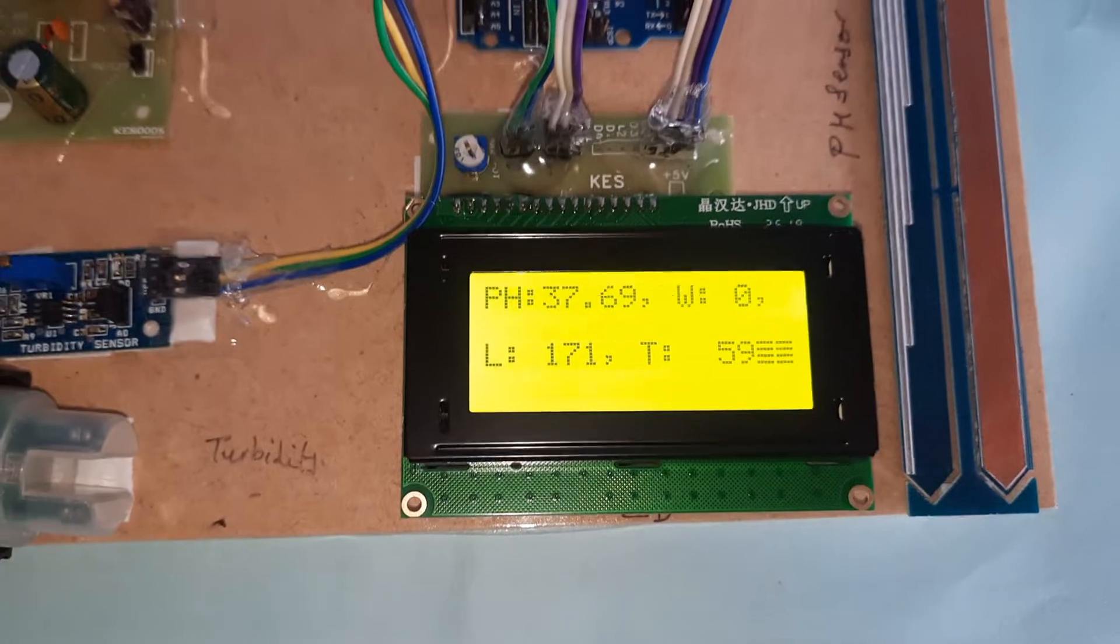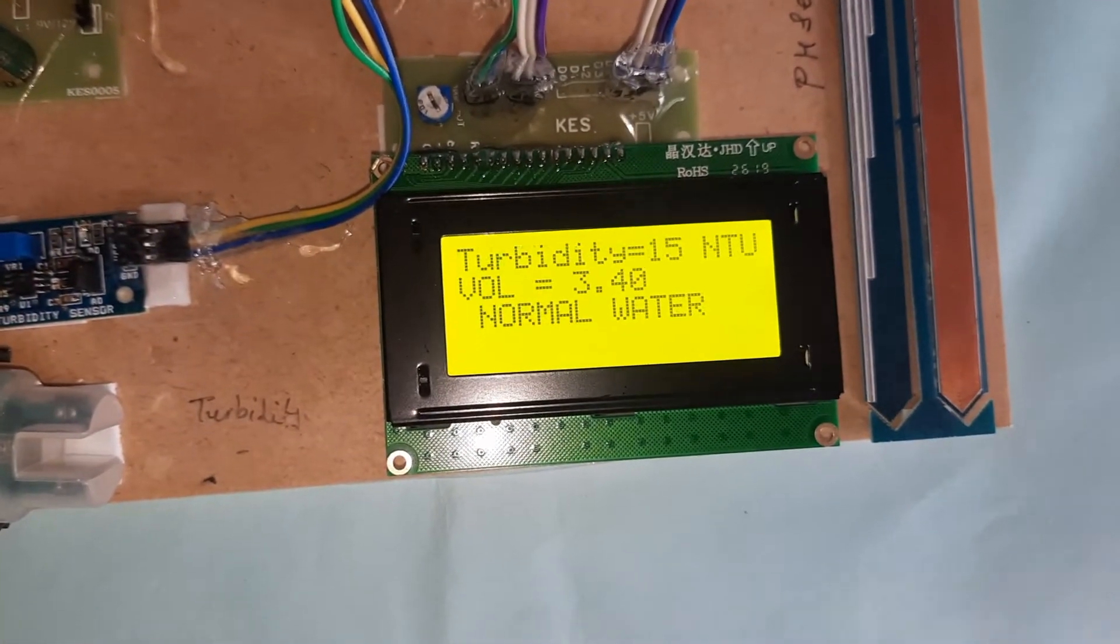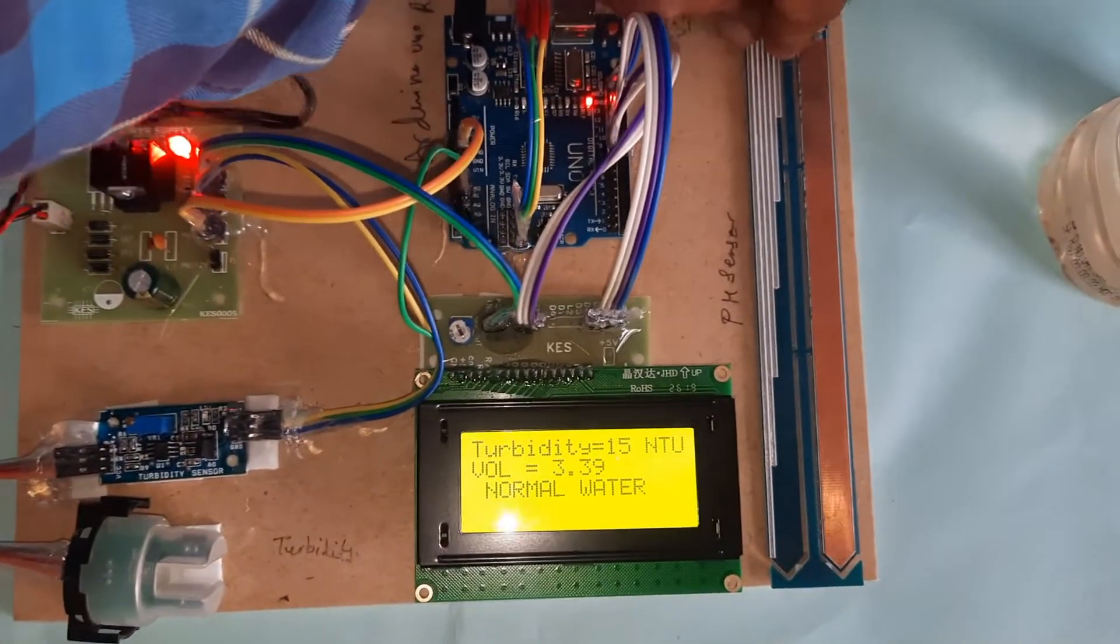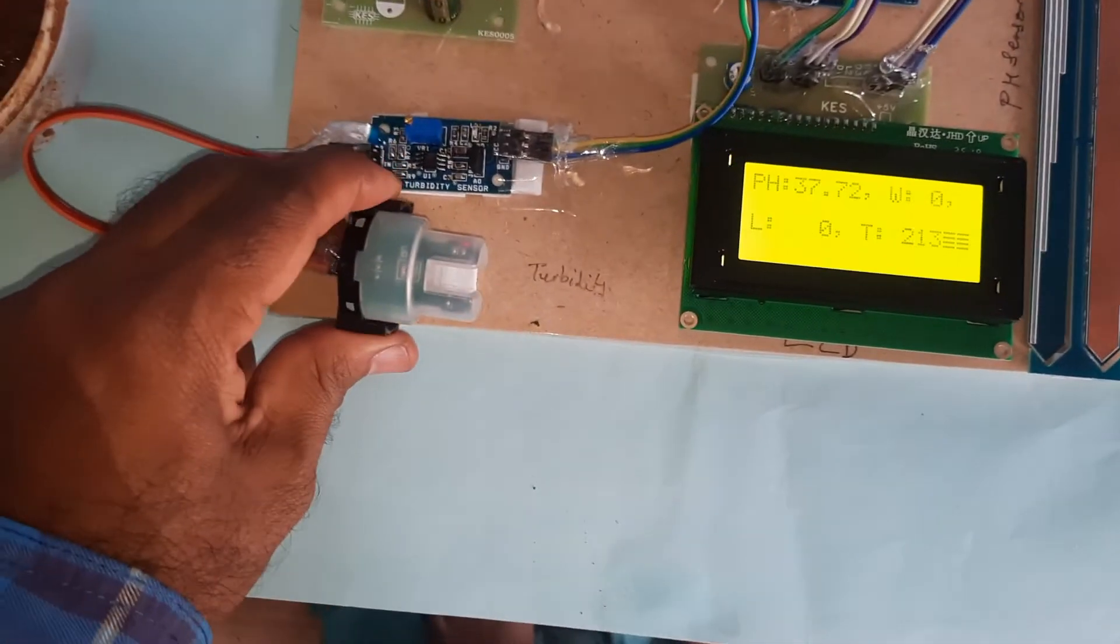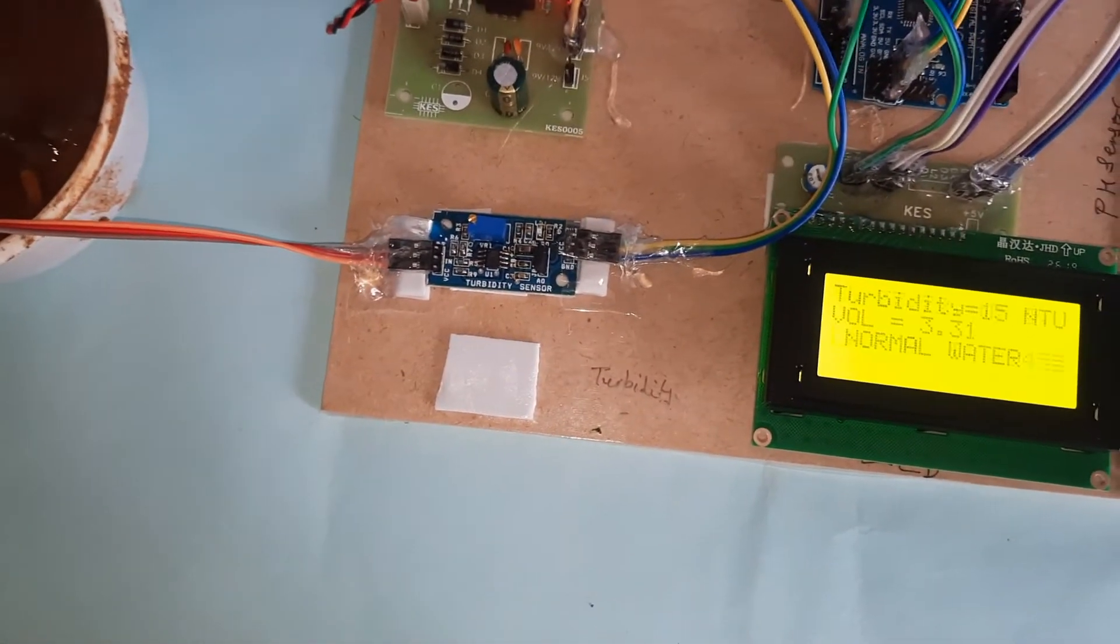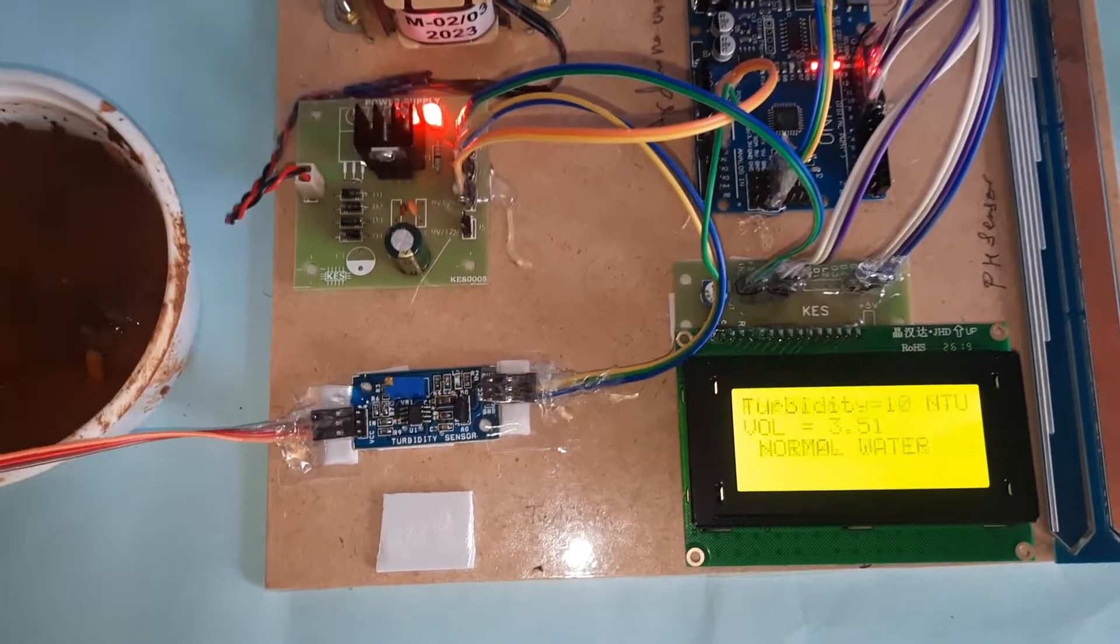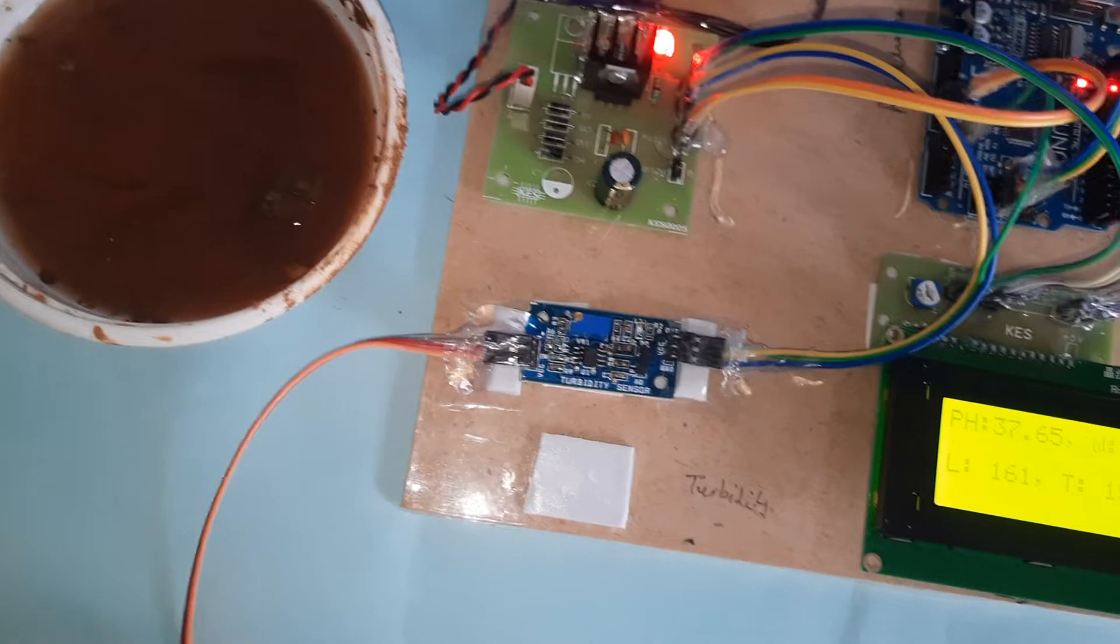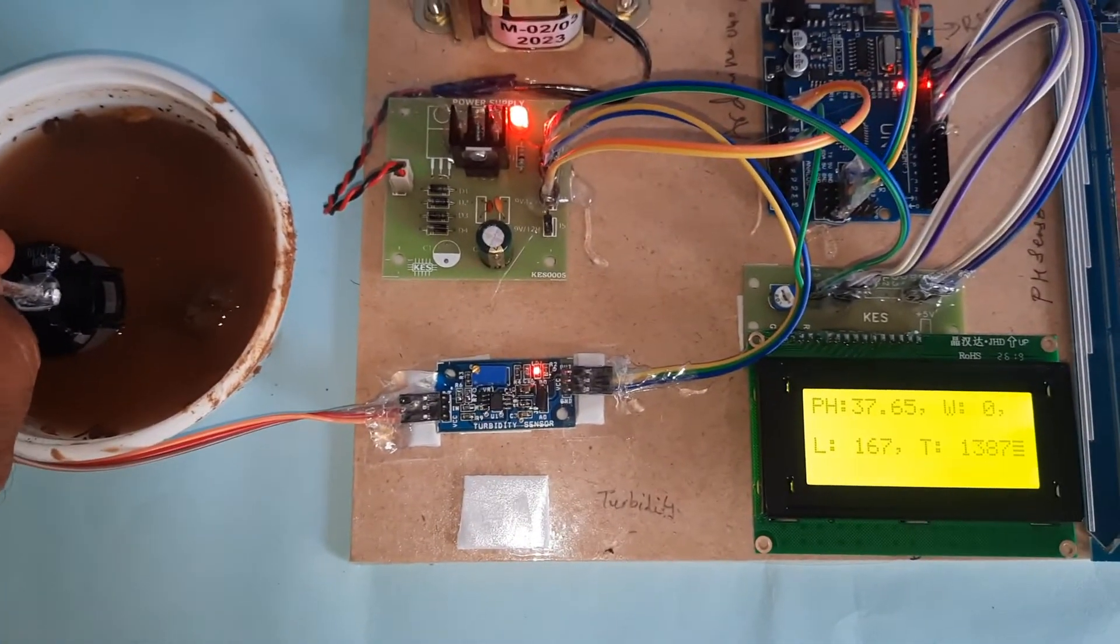So for LDR, I am going to dark. LDR should be zero. LDR is equal to zero. Now I am going for the turbidity sensor. Normal water - LDR is displaying normal water. LDR equals 0, and now LDR equals... mud water.